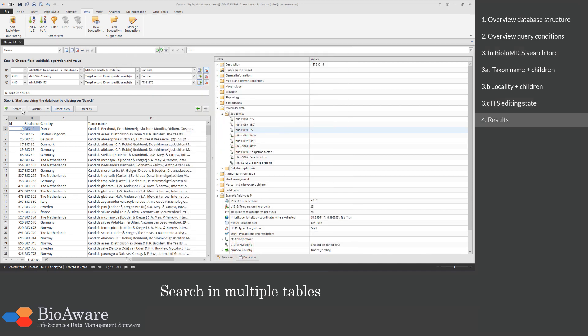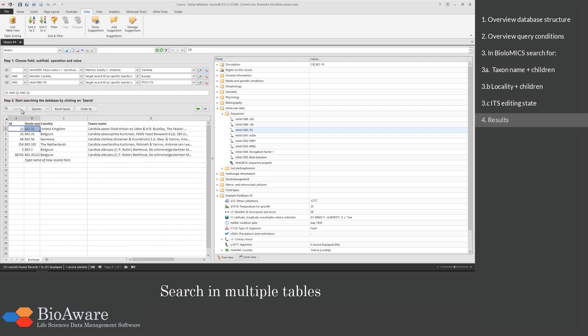When I now click on search, it is including all the conditions and finds the biostrains that match all of them. We have found six records.